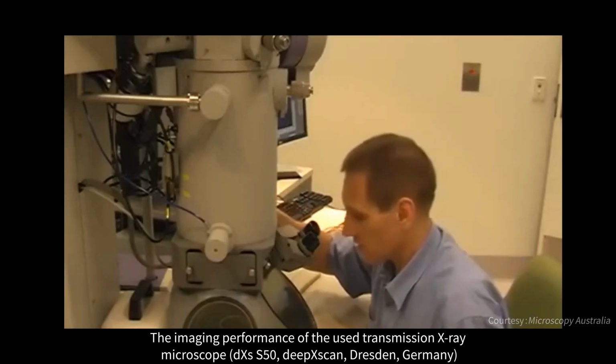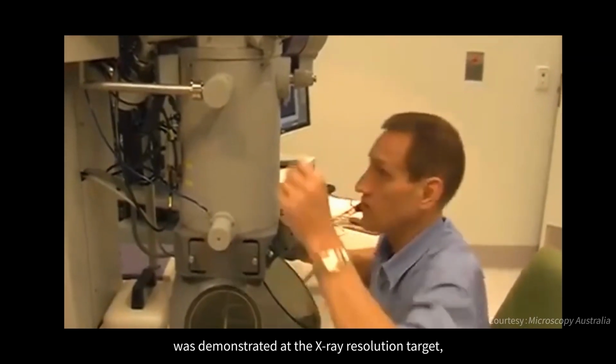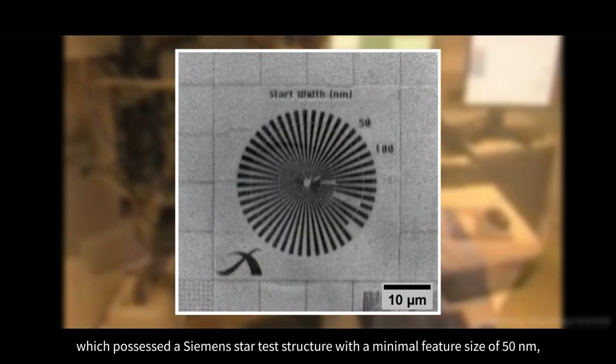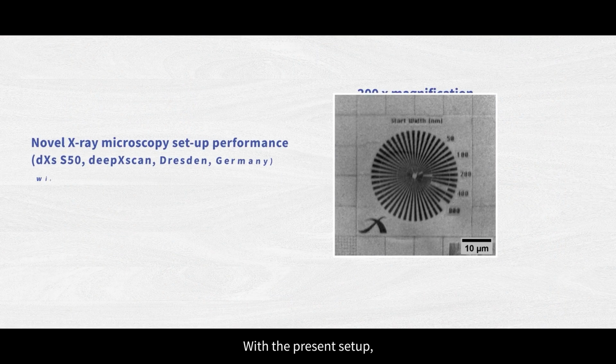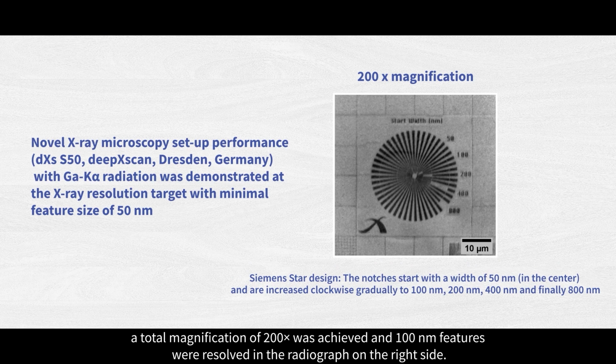The imaging performance of the used transmission X-ray microscope was demonstrated at the X-ray resolution target, which possessed a Siemens star test structure with a minimal feature size of 50 nanometers, patterned into a 700 nanometers thick gold absorber. With the present setup, a total magnification of 200 times was achieved and 100 nanometers features were resolved in the radiograph on the right side.